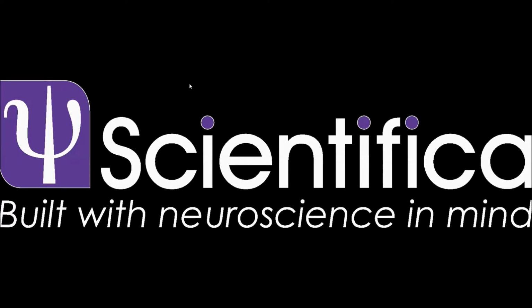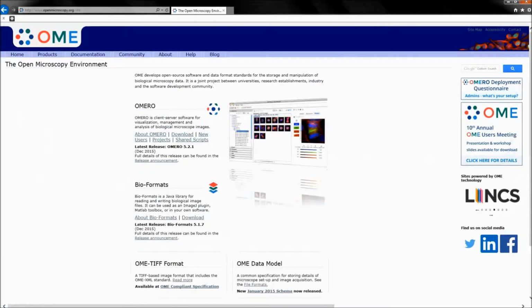Thank you for tuning into this video about SciScan 1.1's compatibility with the OME TIFF format and how it can be used. The Open Microscopy Environment is a consortium of academic labs and commercial entities that create open tools to support the organization and management of imaging data. The OME TIFF format includes a structured block of XML as one of the TIFF tags in the header of the image file. The structure of the metadata is defined by the OME XML schema.